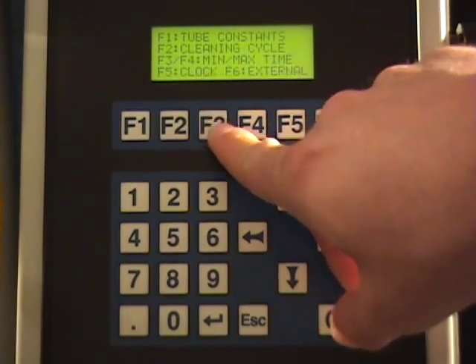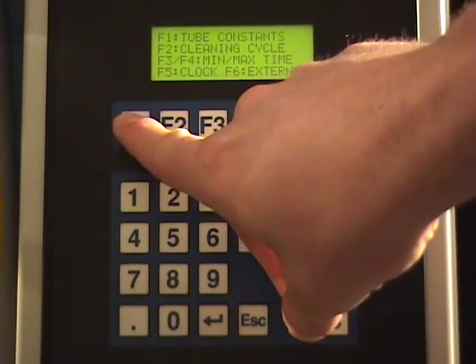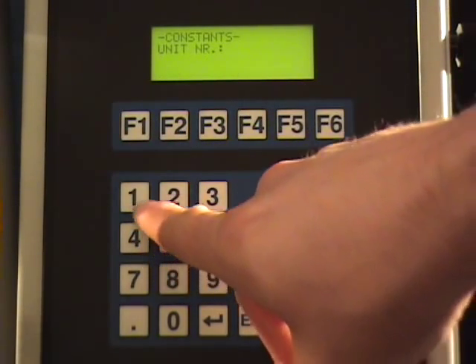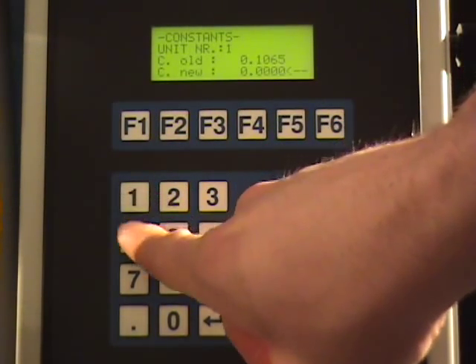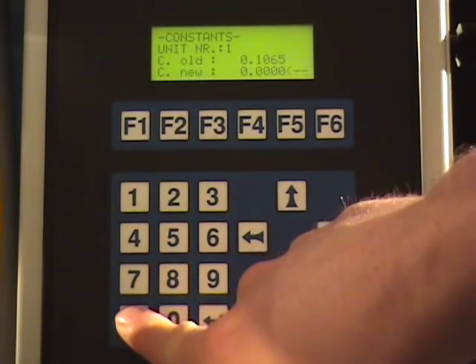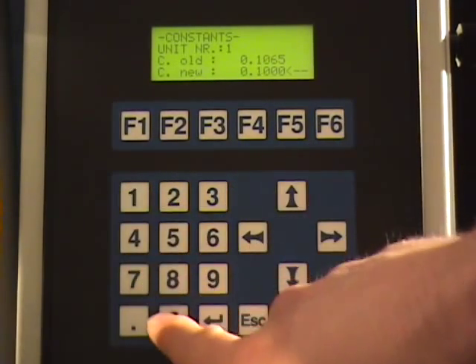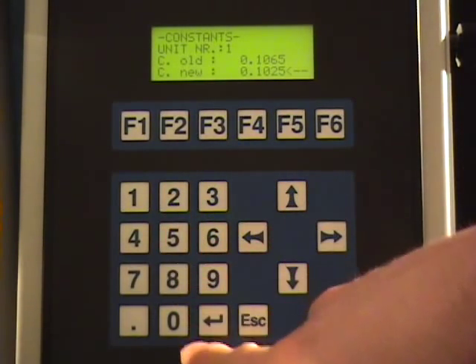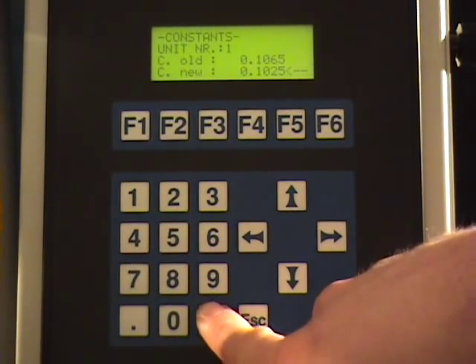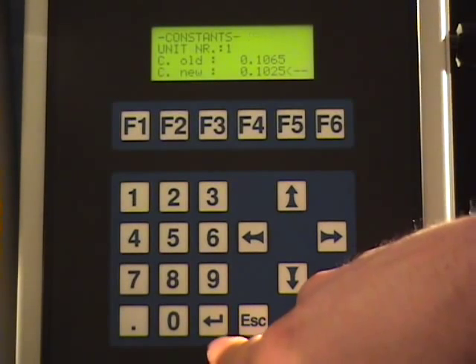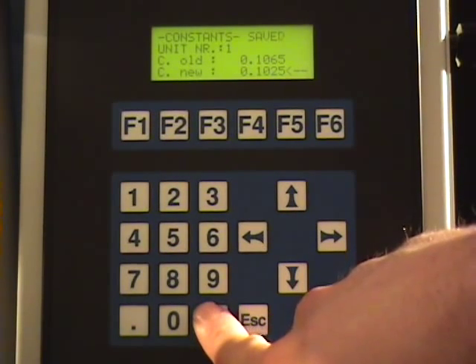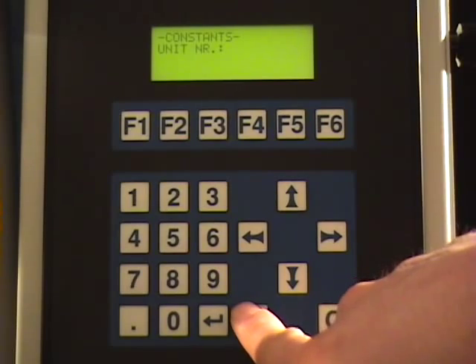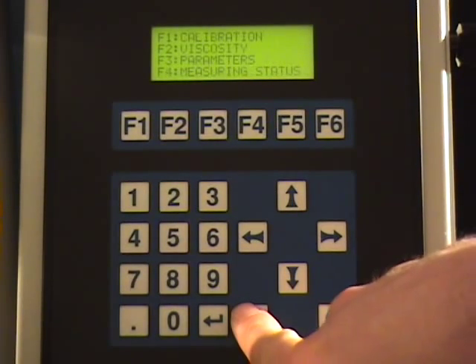Choosing F3 from the main menu gives access to other parameters. After pressing F1 tube constants from the parameter menu, the user can manually enter the tube constant for each tube. During the calibration procedure, the system automatically calculates and stores the tube constant based on the measurement results, but here you can manually enter the tube constant, for instance, in case you've replaced the tube. Press enter to confirm the entry or press escape to discard it.